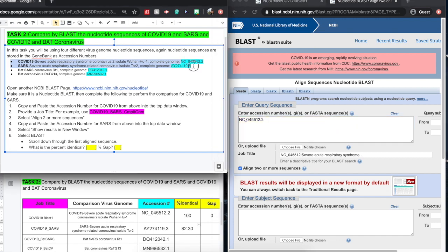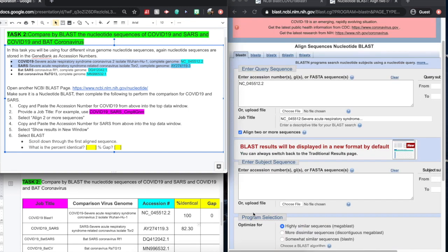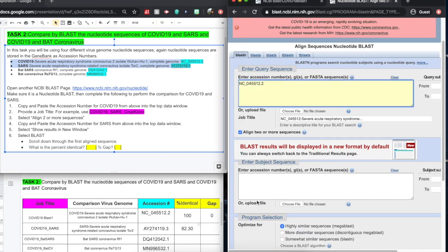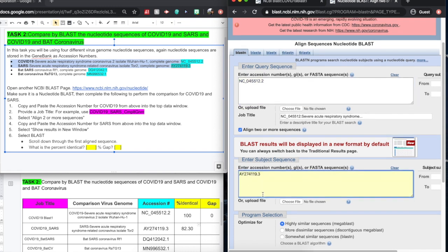We want to put that into a second box. Now, this has already been set up, but you would need to select the align two or more sequences here, and the second accession box will open up for you. Copy and paste that there.